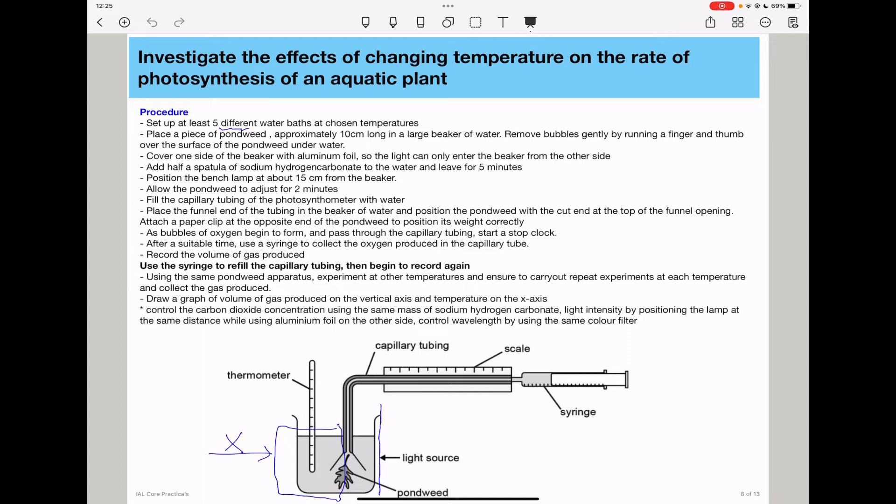Starting a stop clock will ensure that we can calculate the rate of photosynthesis appropriately if we have the time for which photosynthesis was carried out. So after that suitable time, use a syringe to collect the oxygen produced in the capillary tube and record the volume of gas produced.